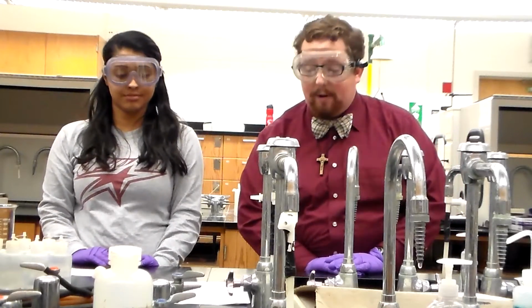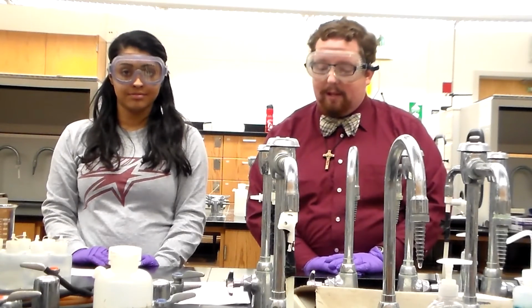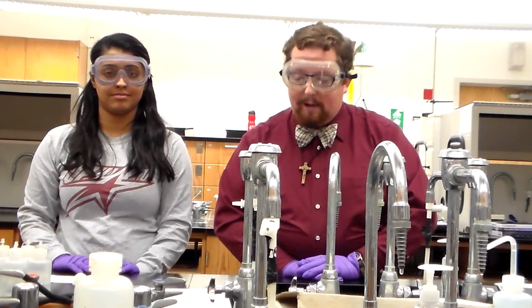Be sure to not touch the paper more than is necessary. Gloves are recommended. While your partner preps the paper, go ahead and prep your mobile phase and your amino acid samples. Get a 1,000 milliliter beaker and pour in 50 milliliters of the solvent. Cover the beaker with an aluminum foil.